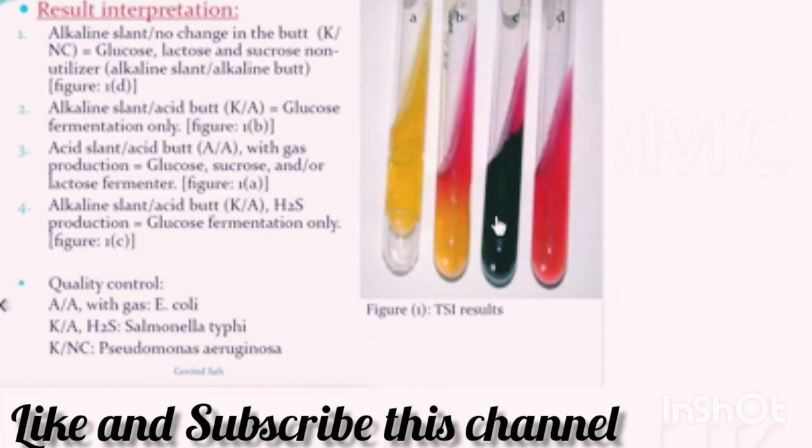So, I will repeat this result interpretation. You can see in this tube there is no change in color, so we can say that its slant is also alkaline and there is no change in the butt. So over here there are some bacteria that are not utilizing glucose, lactose and sucrose. No glucose, no lactose and no sucrose is being utilized.